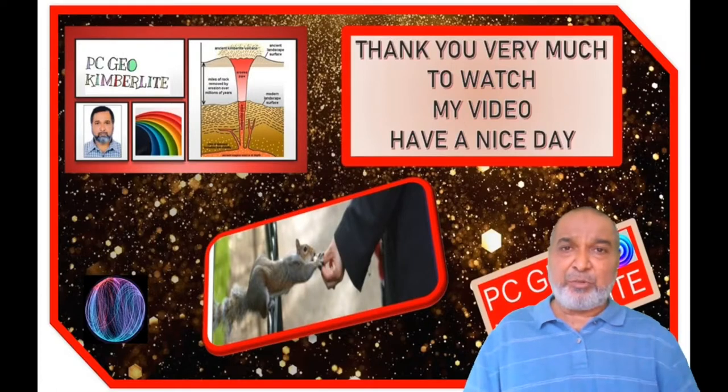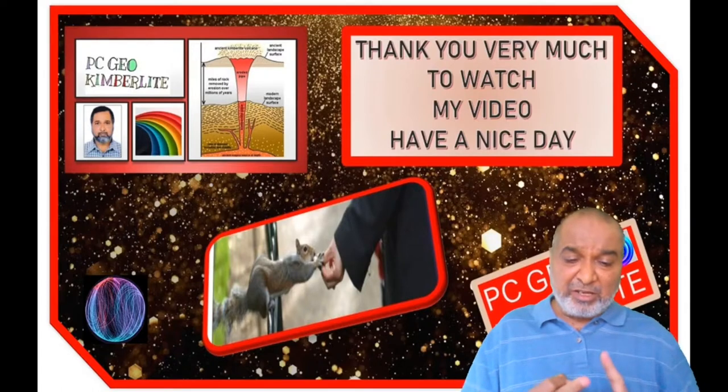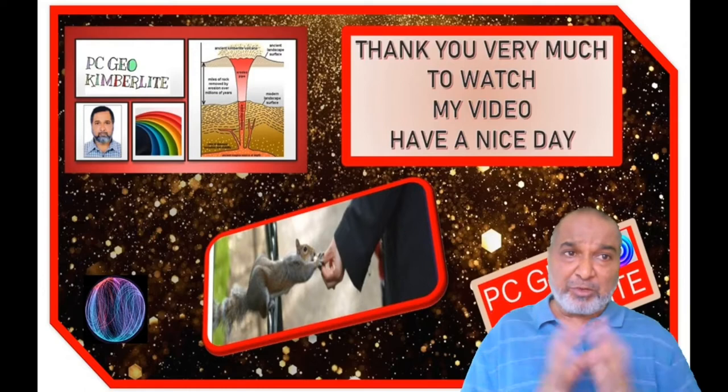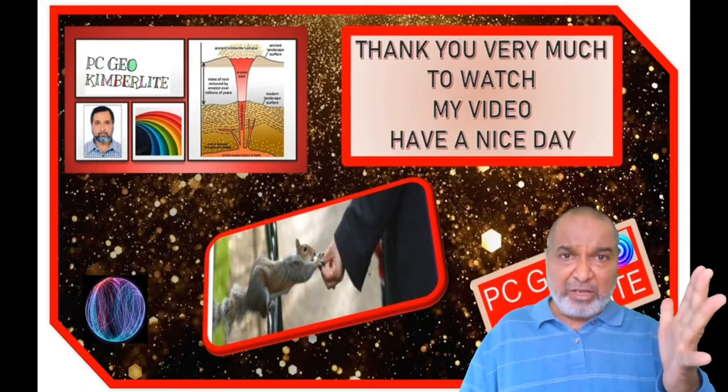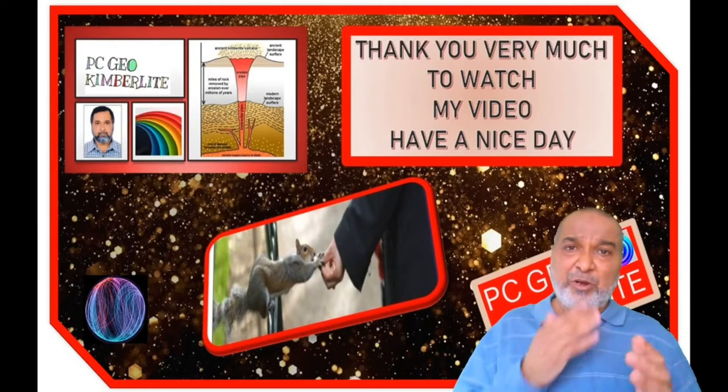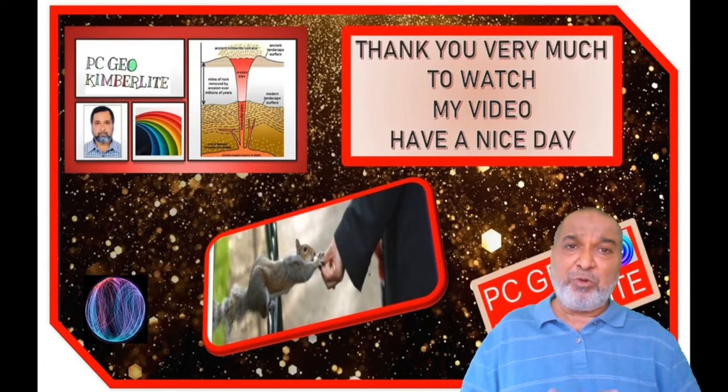What we have seen are the seven properties: the first one, color; second, relief; third, cleavage; crack; twinkling. Color, relief, cleavage, crack. Then what is there in the twinkling property, number 6, and number 7 is pleochroism. So within this order we have to write down: color, relief, cleavage, crack, twinkling, and pleochroism. These are the properties which are very, very important.